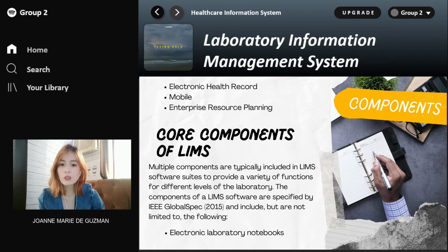Mobile. According to Gartner 2016, mobile LIMS offerings are limited. However, given the widespread usage of smartphones in laboratories, it is preferable that LIMS be mobile-friendly. ERP, or Enterprise Resource Planning, may help with viewing current supplies, estimating storage capacity, and managing location. You should always remember that ERP is the one that helps with the viewing, estimating, and managing. So that's all. Next.